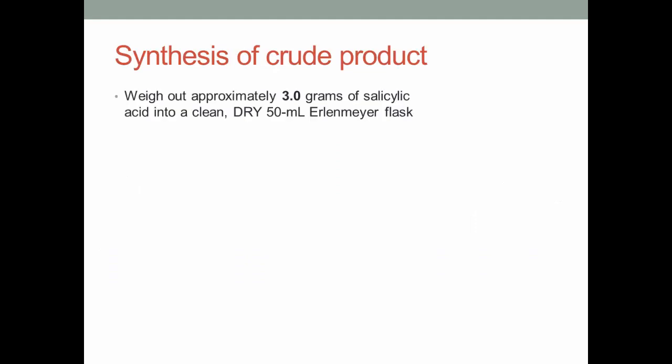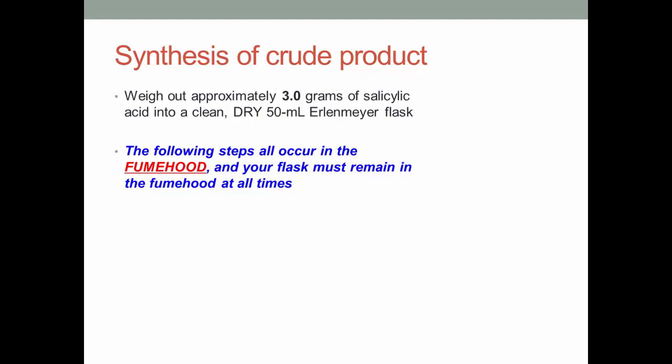To start, weigh out approximately 3 grams of salicylic acid into a clean, dry 50 ml Erlenmeyer flask. The following steps all occur in the fume hood and your flask must remain in the fume hood at all times.